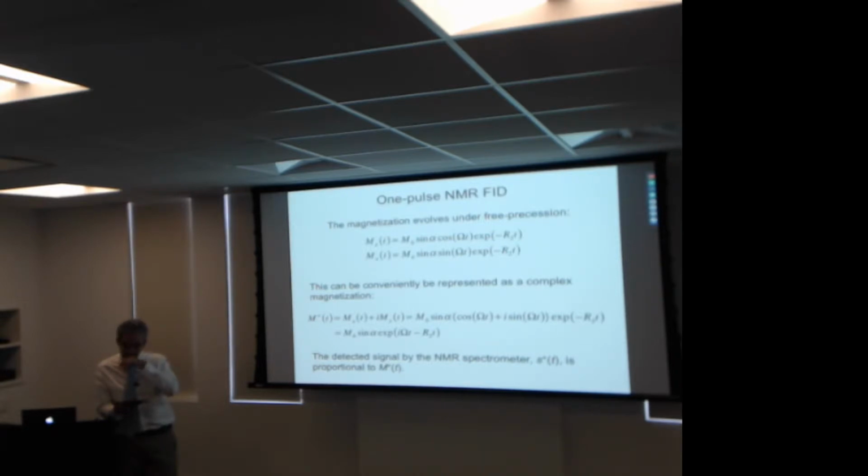Internally, the spectrometer doesn't have any imaginary numbers. It just keeps the real component of the free induction decay in one set of memory locations and the Y component in another set of memory locations, and just manipulates them by the rules of complex algebra. But for us writing things down, this is convenient to do.